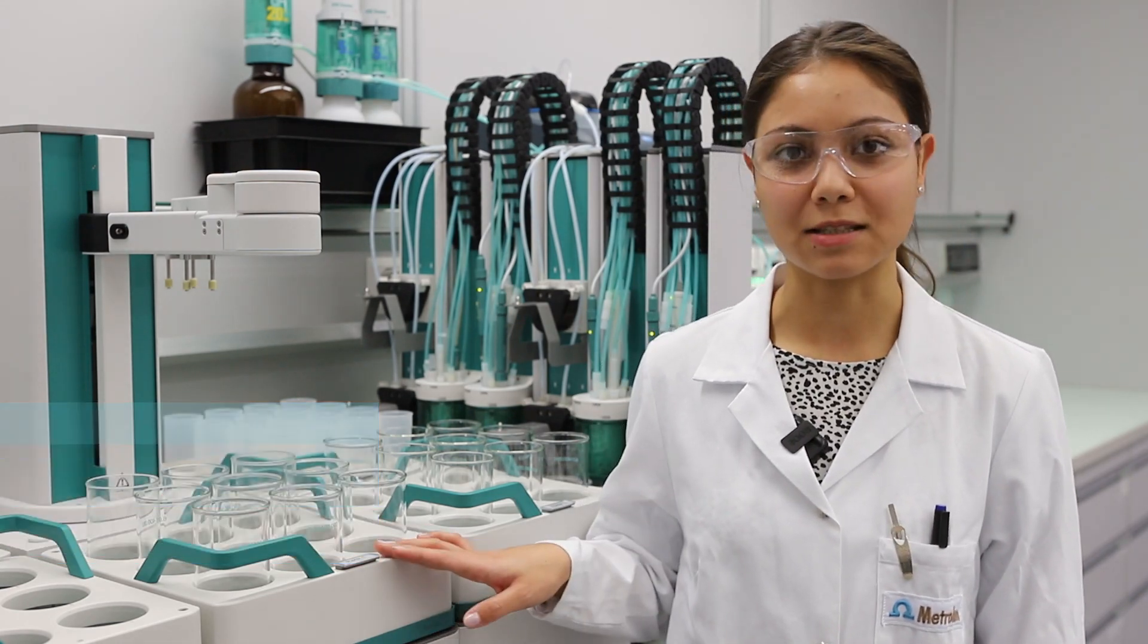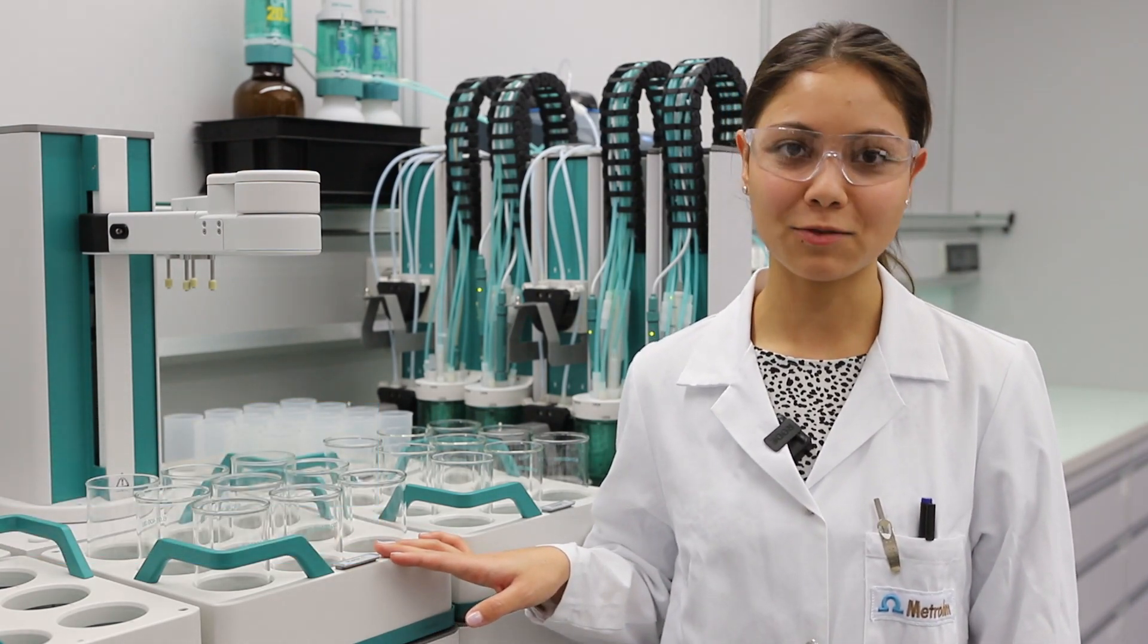Hi, my name is Jennifer and in this video I want to show you a fully automated water system which includes sample transfer.